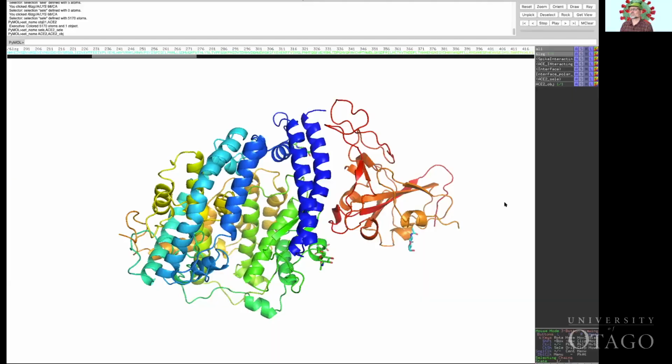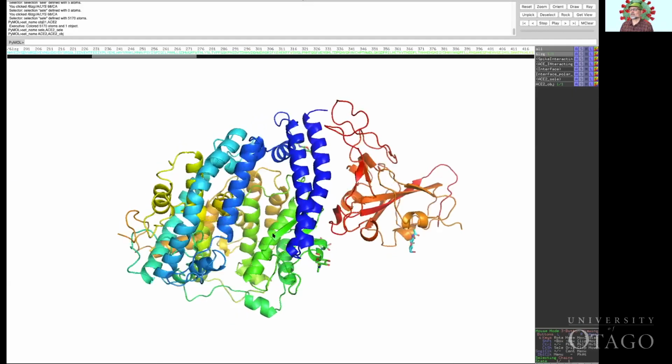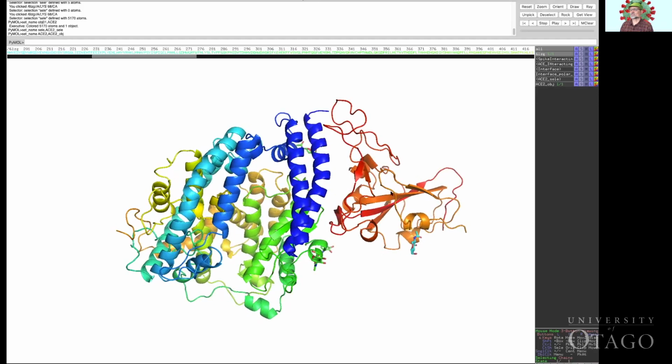And so if we go to PyMOL to take a look at that, let's reshare here. That shows us a little bit of the spike protein on the right and the ACE2 receptor enzyme on the left. So if I'm interested in that interface, how do I go about visualizing that? Well, one way is to build up a selection which focuses on just the interface. And you can do that by starting with a selection which is just the ACE2, this one here.